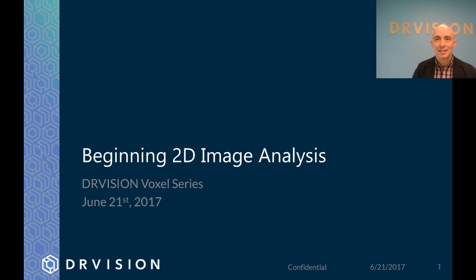This is the second installment of the DR Vision Voxel webinar series, where we will be looking at a practical approach to beginning 2D image analysis. We're aiming this at entry-level or perhaps intermediate scientists who want to take this practical approach to expanding their image analysis skill set. My name is Willie.